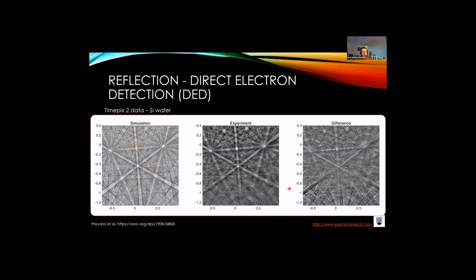effectively high angular resolution within the diffraction pattern. And if we set this up badly in some regards, with the pattern center and detector in a poor position, we can start to see some physics of the scattering. Broadly speaking, the electrons that hit the bottom of the detector have scattered further in the sample. And that changes the brightness and contrast along the band. You can see this as you zoom along here. You can see there's a cool change in the band width and the intensity because the energy of the electron transport inside the sample has changed.